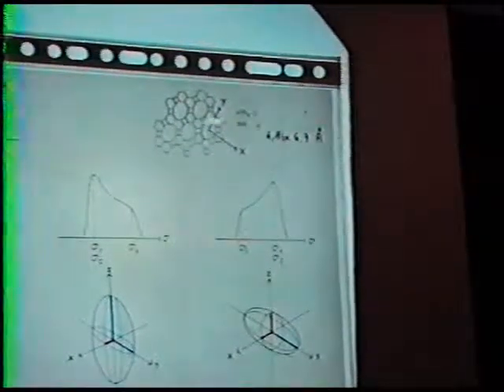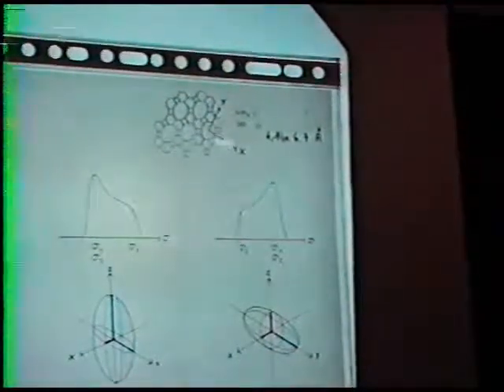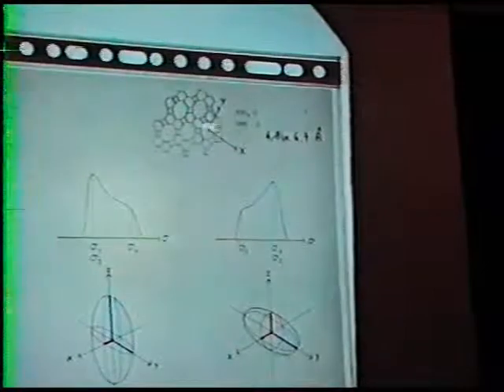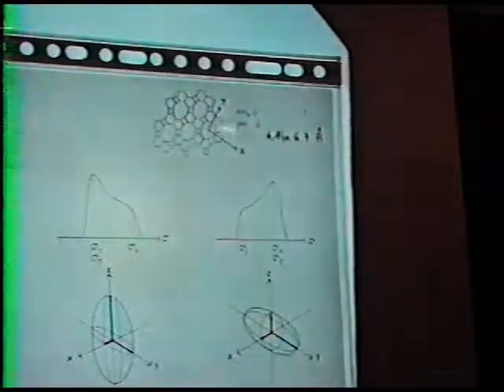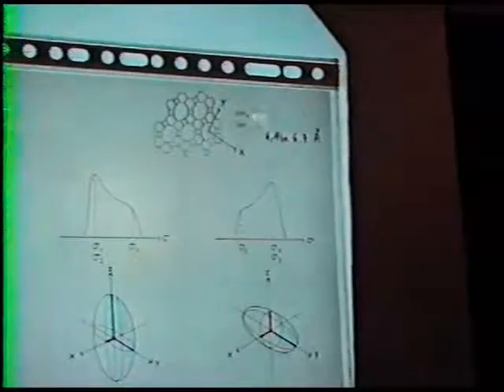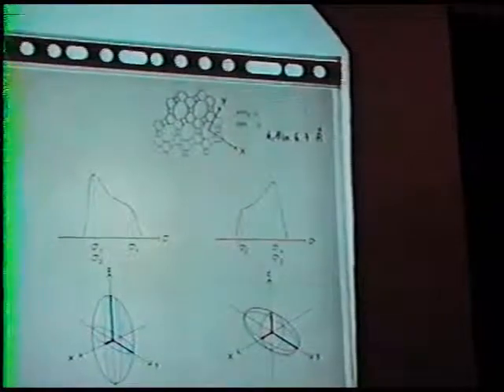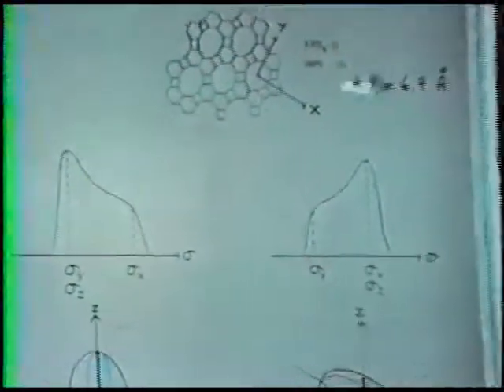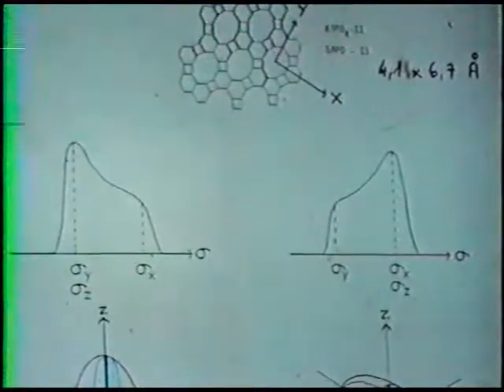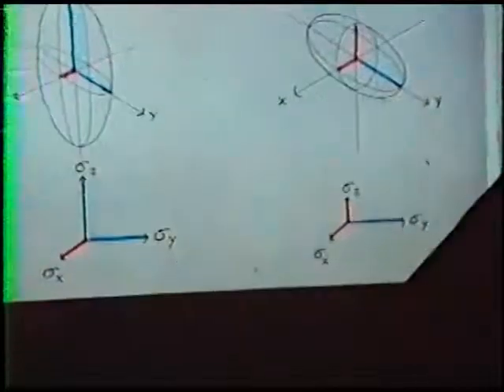In that case, when xenon is adsorbed, we have a permanent perturbation along the x-axis. On the contrary, in the y-axis and in the z-axis perpendicular to this plane, the xenon is completely free. And so you must detect in this case an anisotropy of chemical shift due to this permanent perturbation in only one direction. And in that case, you detect such a signal.